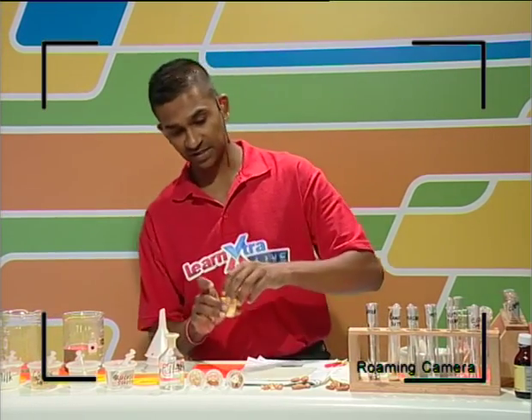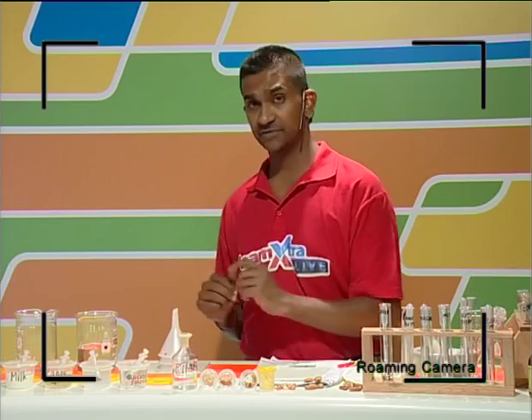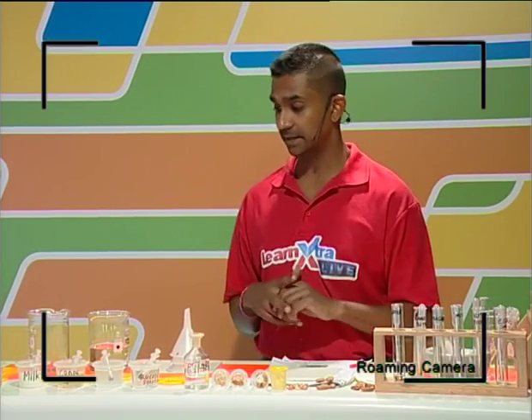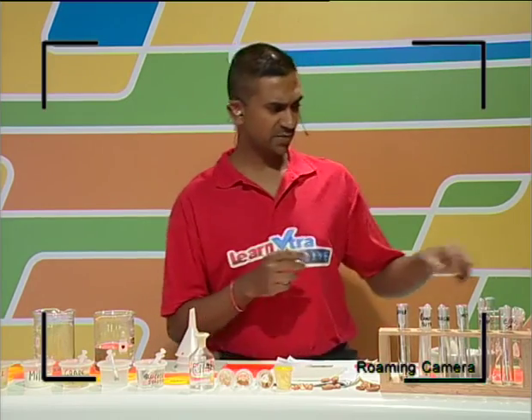I also have margarine in here, guys, which is a fat as well, and we have that with our bread, so it's very important to know the concentration of lipids in there. So very quickly, to touch base with what we're testing: we're testing for the presence of lipids, and we're using ether. And this is quite a simple test, guys.